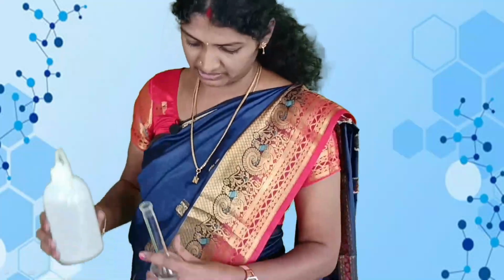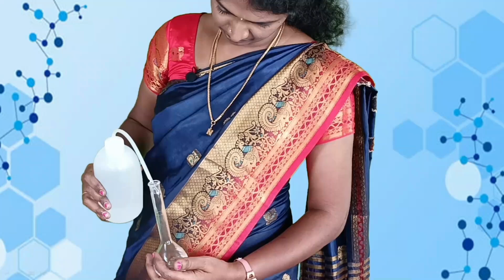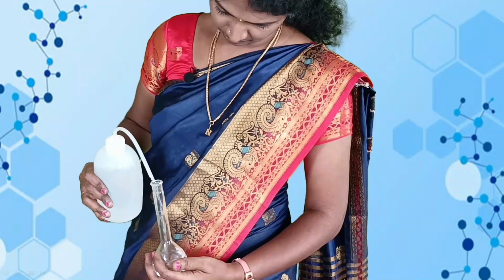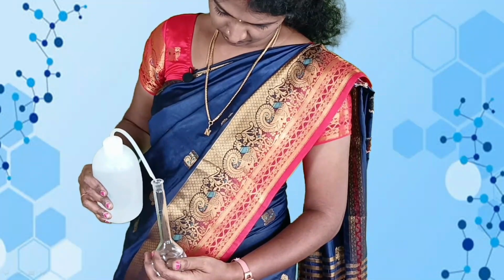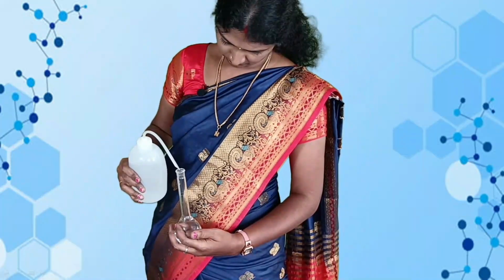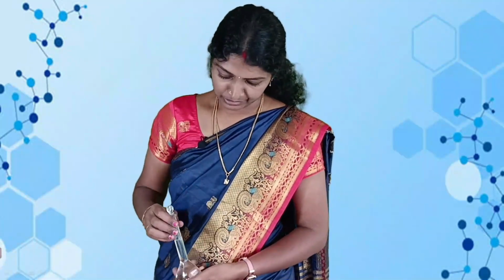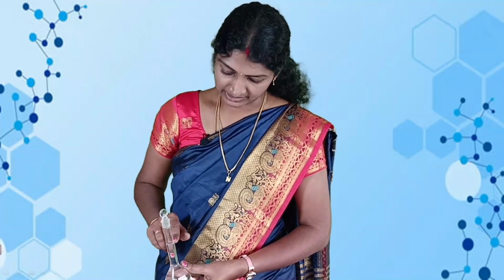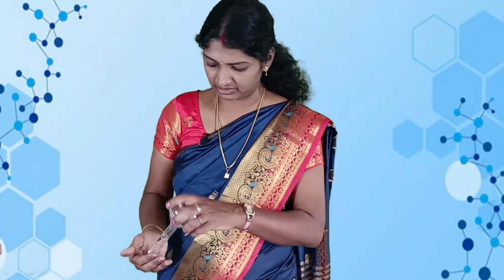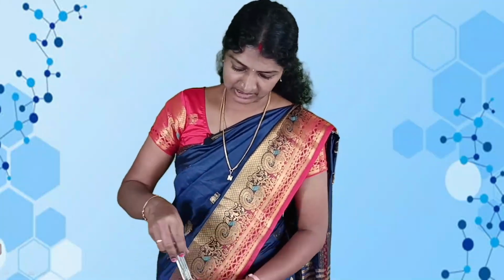The given unknown solution is made up to the 100 ml mark using the conductivity water. Then shake the SMF for uniform concentration.